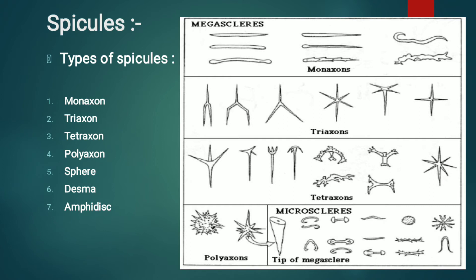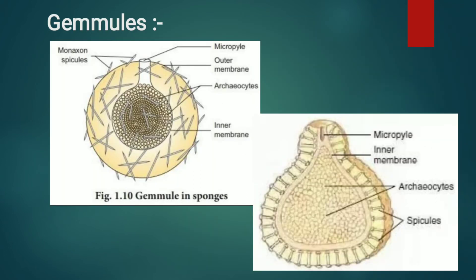In this picture we can see the megasclere types: monaxone, triaxone, tetraxone, polyaxone, and some microsclere types. This is all about the spicules.